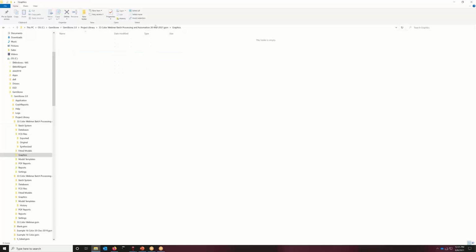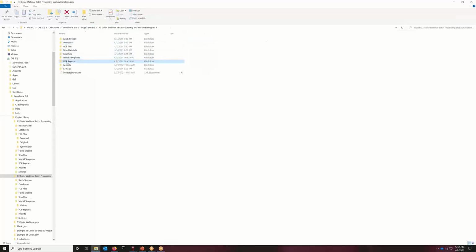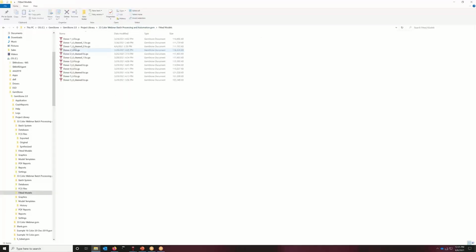I also have a folder for graphics, my model templates, and then the PDF reports would be found here as well. Come back here and open that one. So I have a series of PDF reports, and my fitted models would be here as well if I went through that whole batch.